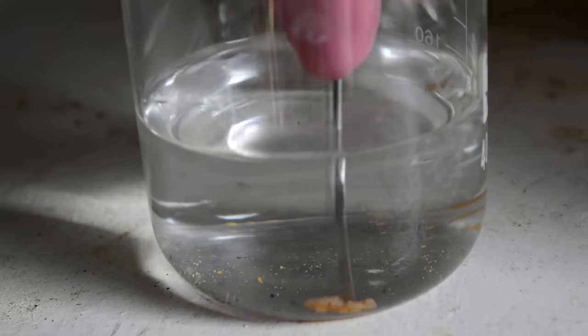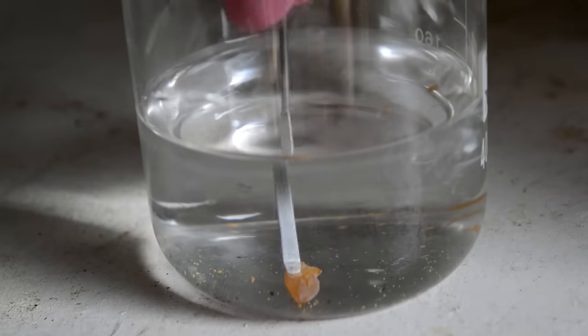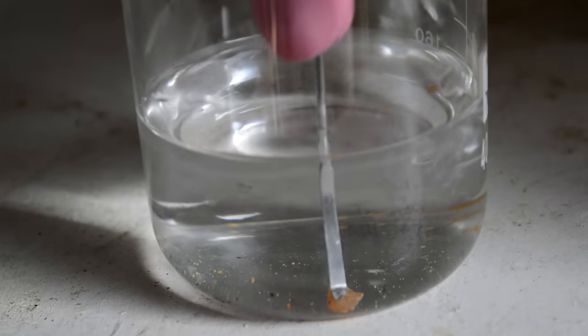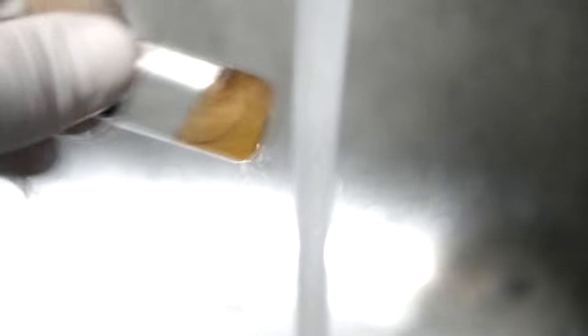White phosphorus is stored underwater, which it doesn't react with, and that stops it from reacting with oxygen in the air and bursting into flames. It's a waxy solid but it's not really that soft, so it can be quite hard to cut. I find it's easier just to melt the bulk solid underneath water — seeing as the melting point is only about 44 degrees Celsius, you can do it under a stream of hot water.